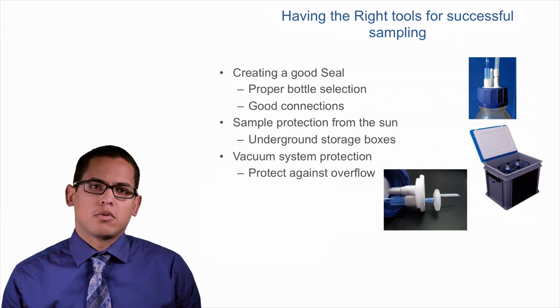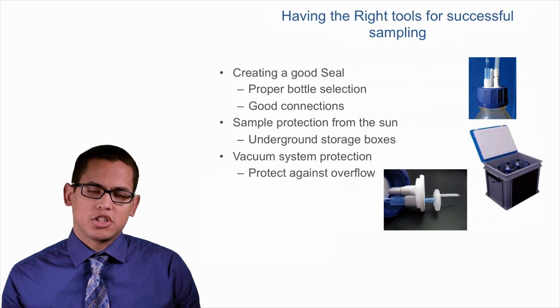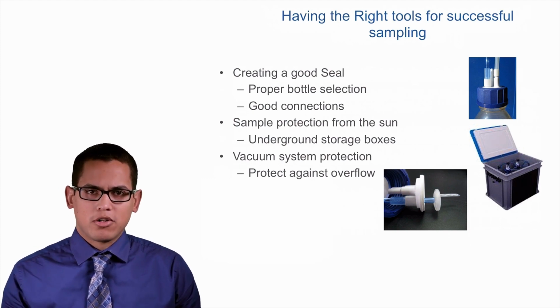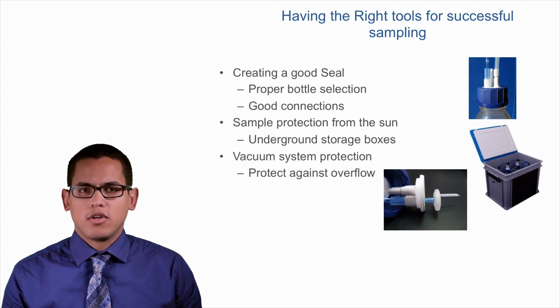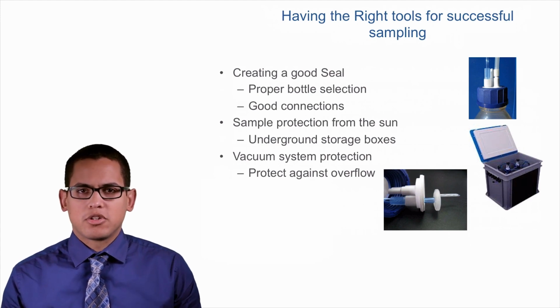So here's a picture, right near the bottom, of a Teflon stop that will actually seal up if it gets wet and cut off the vacuum to the bottle. Once the level lets back down and it's able to dry out, it will begin applying vacuum again. So these are good tools to use when setting up, especially a continuous and tensiometer controlled system.